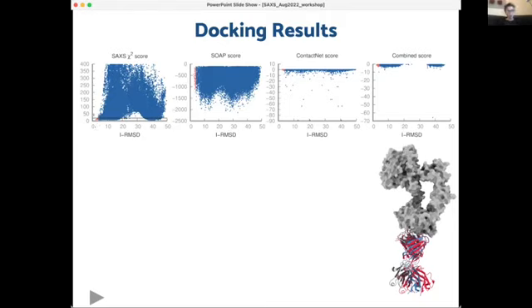They all have a SAXS chi-square score that is low, and there is nothing above some threshold, which means we can exclude all the models above this line, which is quite a lot. And this is really the power of SAXS. It allows us to exclude many, many models.